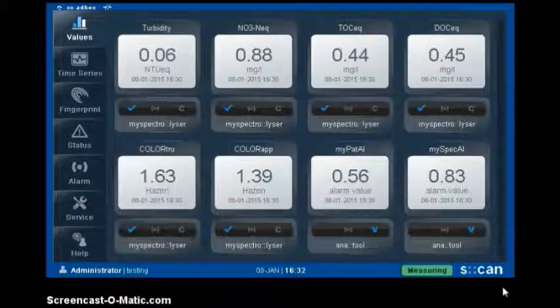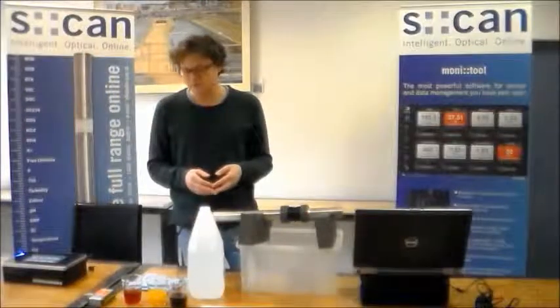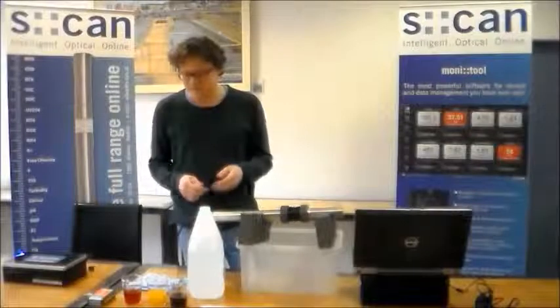We can now see that the new Anatool alarm algorithms started to work. They have collected the first input measurements, and we see the first results of the new parameters. We will now continue by testing the behavior of the alarm parameters to simulated contaminations.